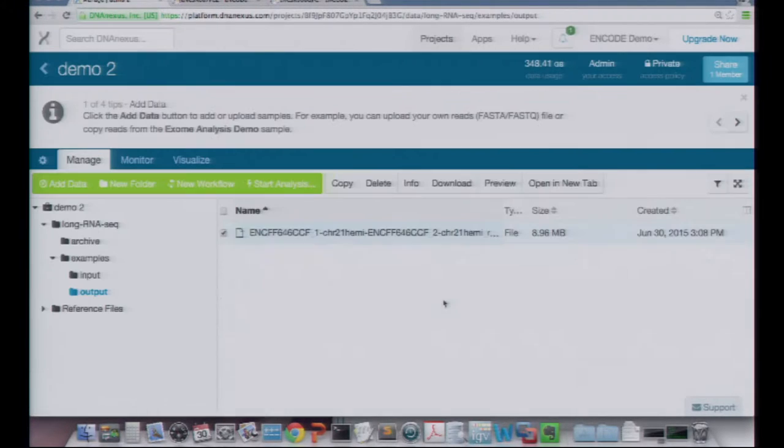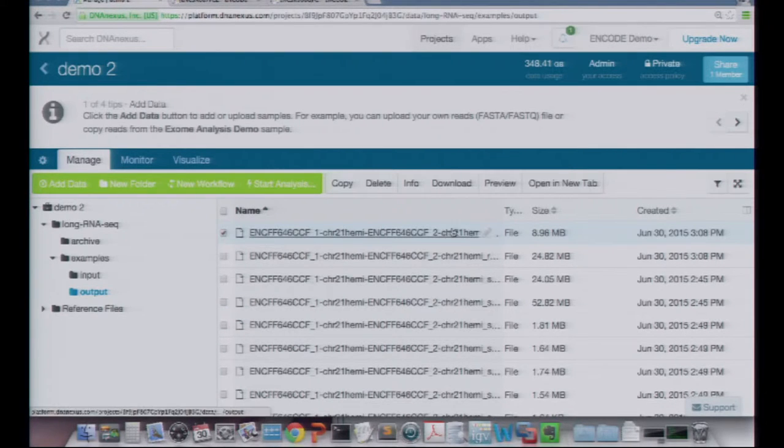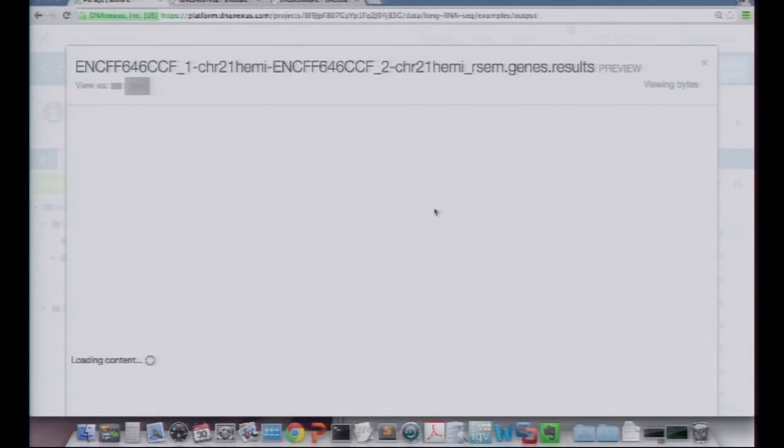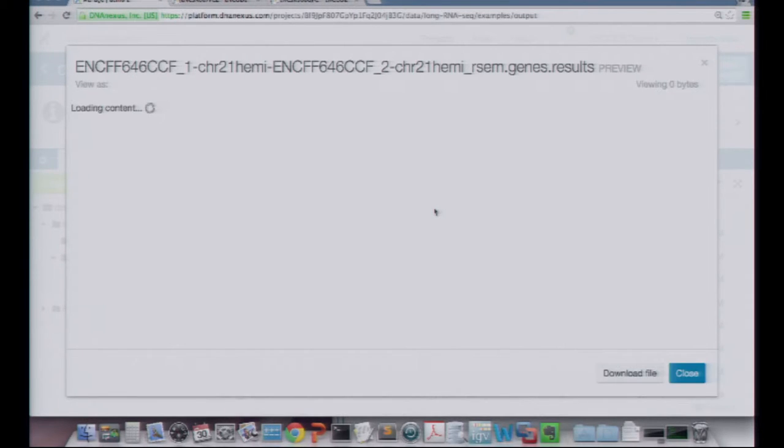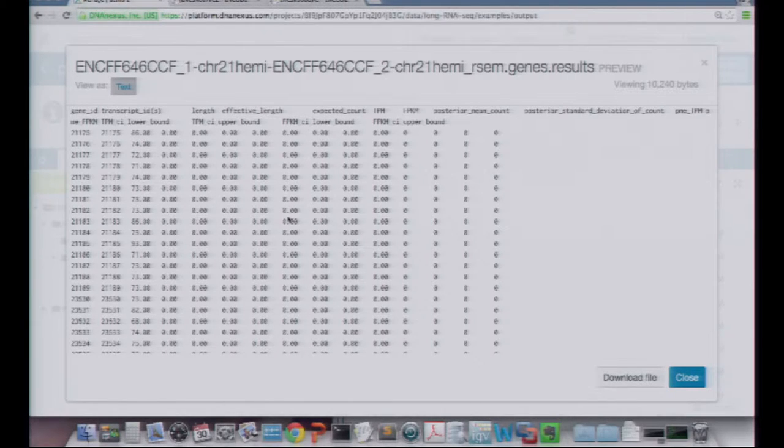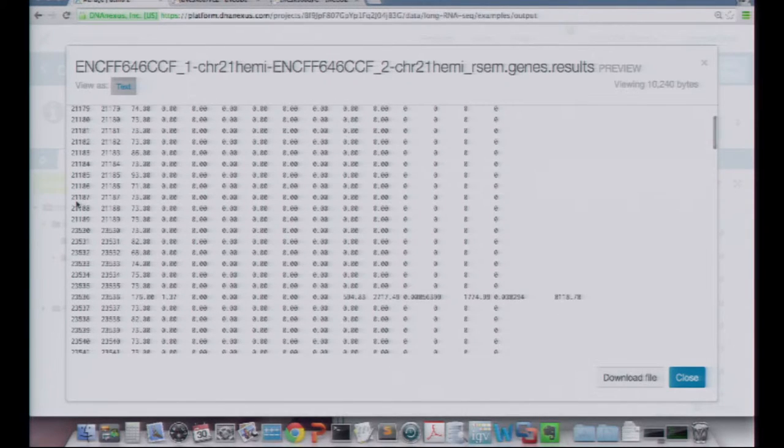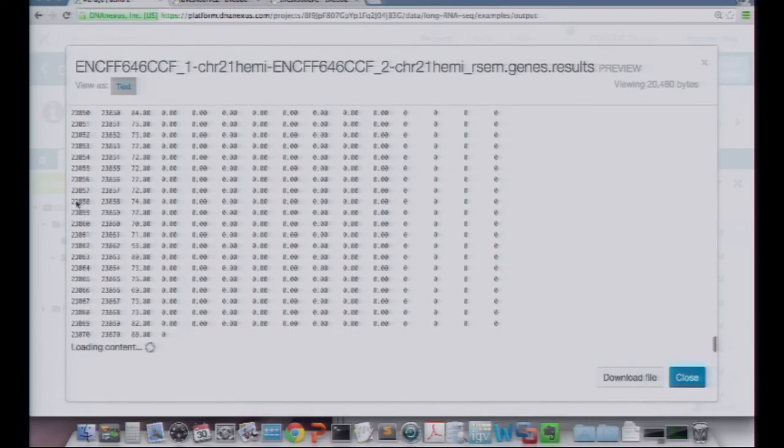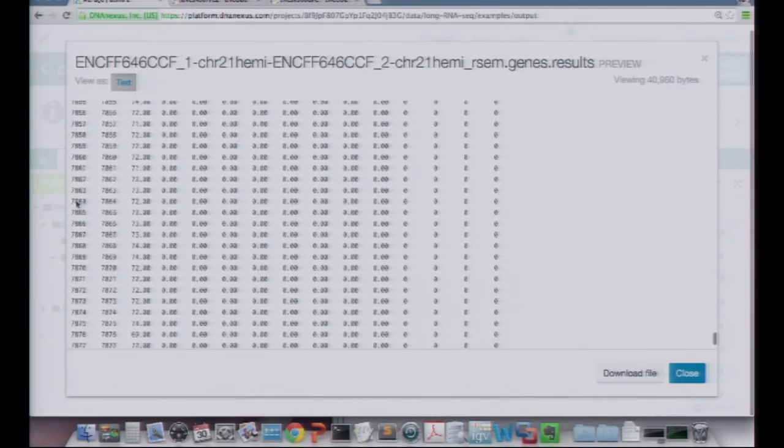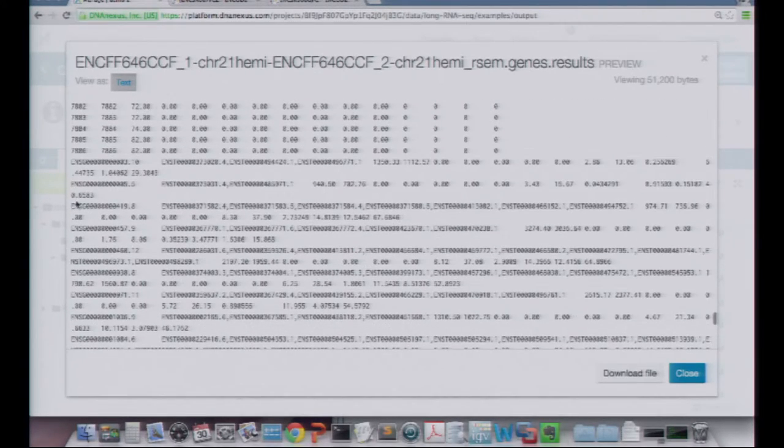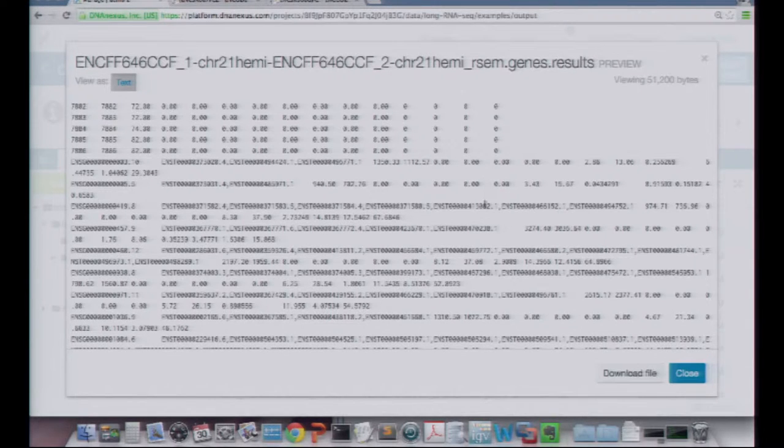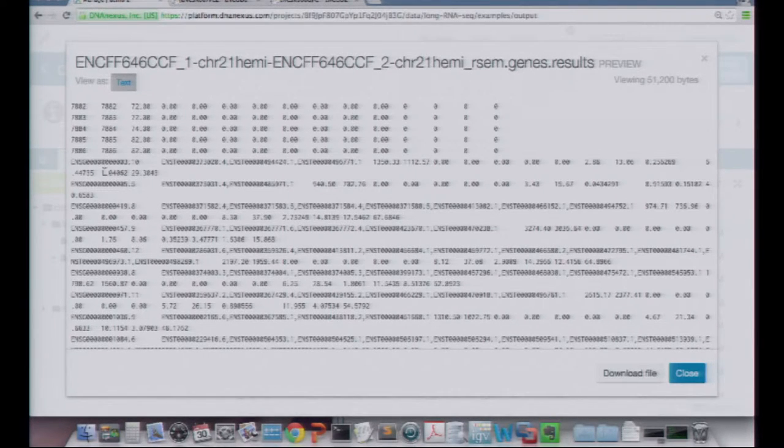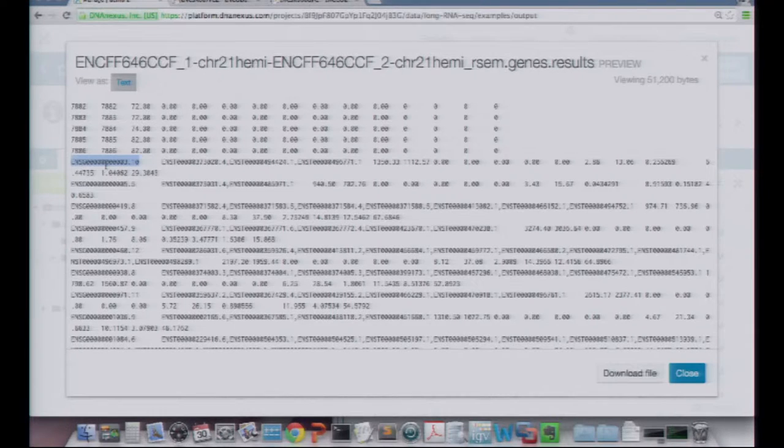So, I can't really, I don't have a visualization for this kind of file. I mean, it's a nine meg file. But I think I can preview it, sort of show roughly what this file looks like. It's going to be mostly zeros, because it has an entry for every gene in the human genome. And not all of them are in the middle of chromosome 21. But you can see that it's got, these are all, these have funny IDs, because they're tRNAs at the top, if I can go down, find, all zeros. Oh, there we go. There's some genes. So, this is the length of the gene. These are still all zeros. If you download, if you get this file, this RSIM file, and you download it, it's a little bit tricky because of the format. But if you look for genes that are on chromosome 21 by the ensemble IDs, you can actually get a number.